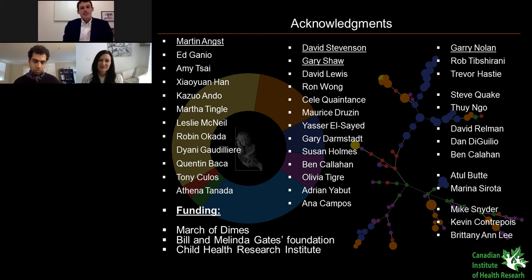Well, thanks for asking this question. It's obviously a very important question. What we're doing with mass cytometry, as well as other omics platforms, is we're looking at the peripheral immune system or maternal blood in general. And so obviously the action, or if you want to say it another way, the epicenter of these various pacemakers of pregnancy is the fetus itself and the placenta.